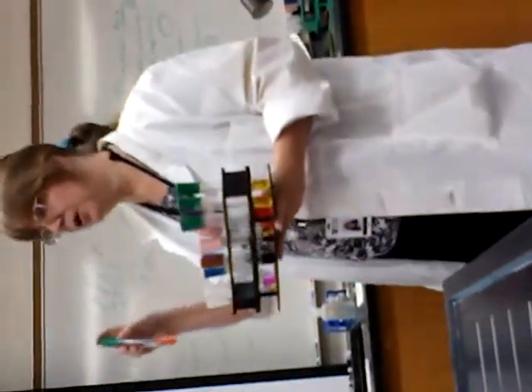You have the Durham tube here. That is a Durham tube. If the organism... you put a sugar in this, we put in glucose and another one we put in lactose. You can do a whole range of these. You can do lactose, fructose, you can do sorbitol, you can do mannitol, you can do mannose. You can do a whole array. But we did glucose and we did lactose.